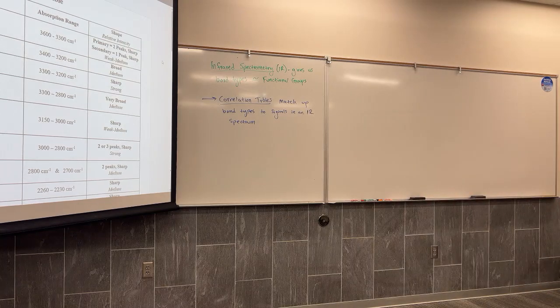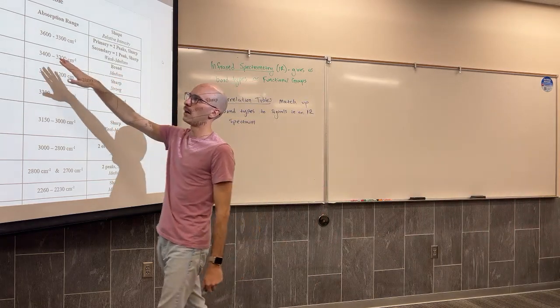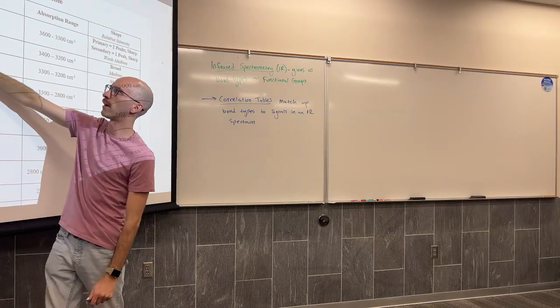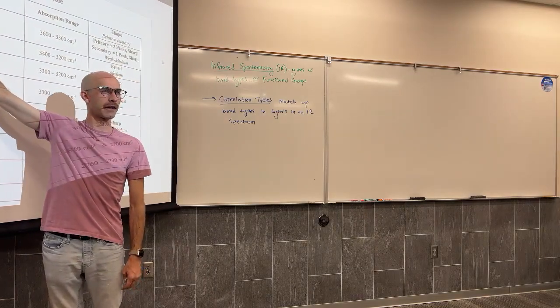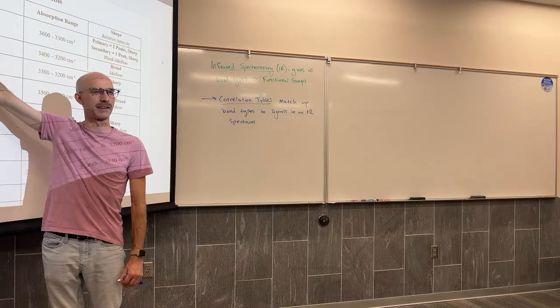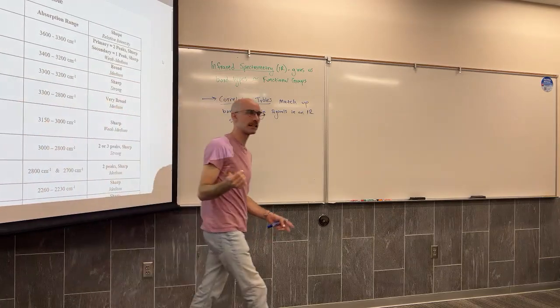And there's actually a couple of things that we notice about the bond type. If you look at the very first row, we have the NH of an amine, which is actually maybe too generic. This should be amine and amide. But it says after it specifically stretching.